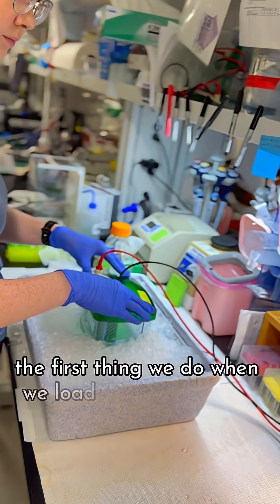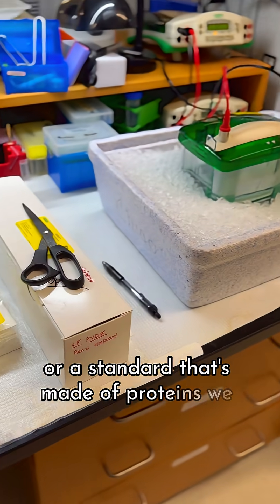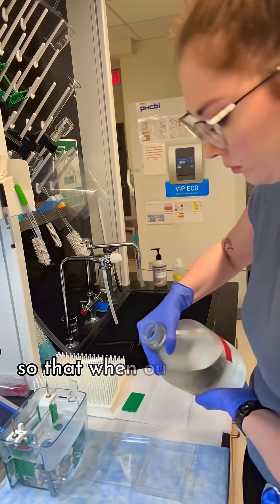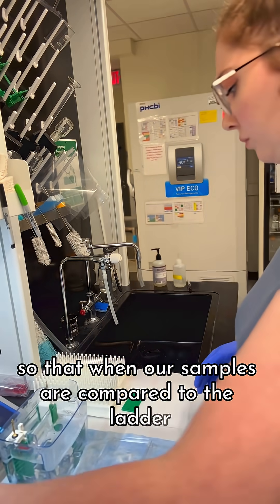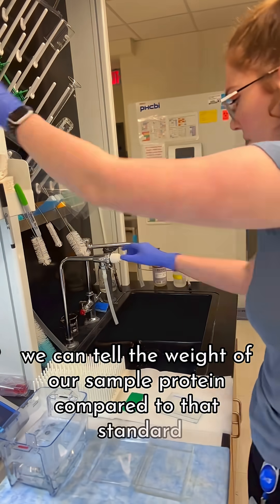The first thing we do when we load a gel is actually load a ladder, or a standard that's made of proteins we know the weight of, so that when our samples are compared to the ladder, we can tell the weight of our sample protein compared to that standard.